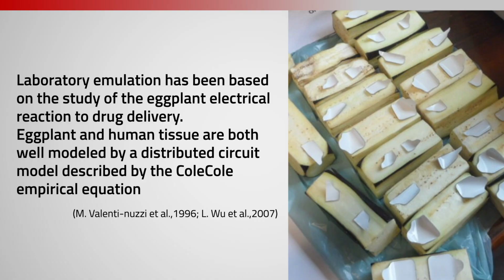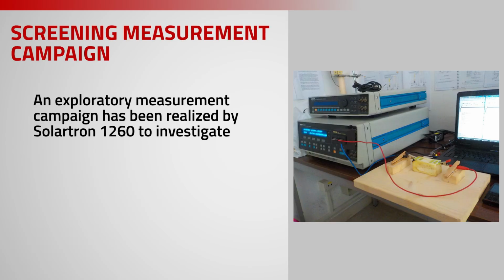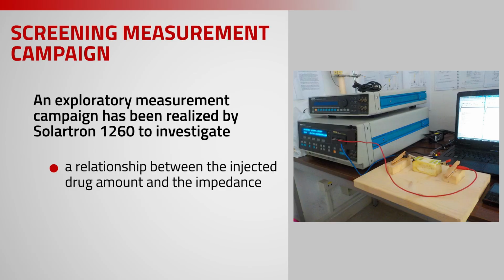Rectangular-shaped pulp sample blocks were derived from eggplants. Impedance spectroscopy was carried out by using a Solartron 1260A impedance analyzer. Pre-gel electrodes with one of the largest surfaces on the market were selected in order to mitigate the impact of the contact on the measurement.